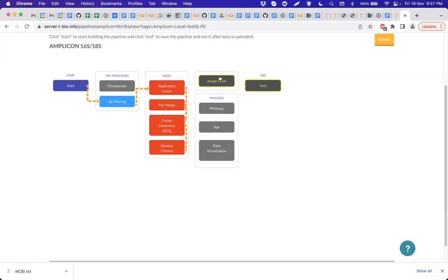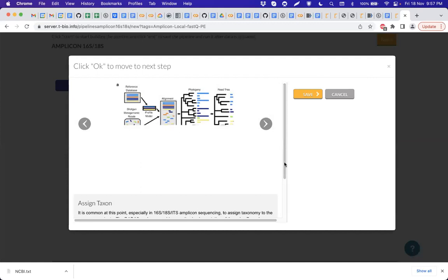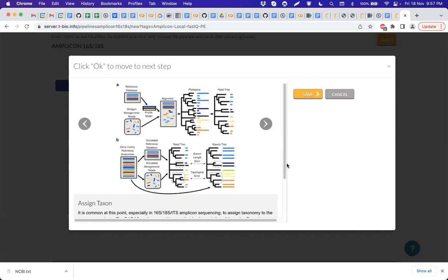And now we can use these OTU sequences to find out from which microbe or bacteria they are from. This is usually done by comparing with the Silva database, mainly the Silva database. There are some options to provide additional databases locally, additional defined databases. In here also you can do that, but for 99% of the purposes, Silva is going to be sufficiently suitable for characterization.